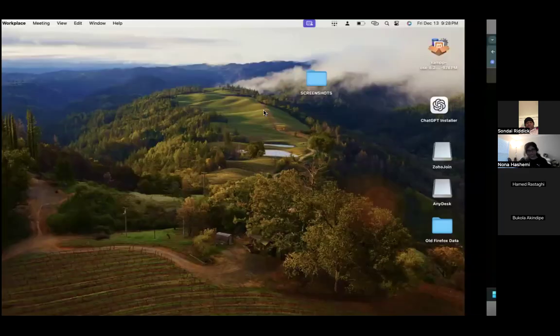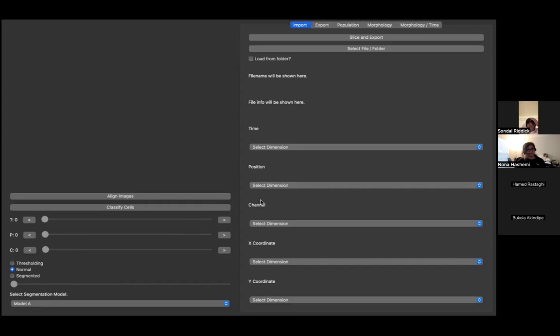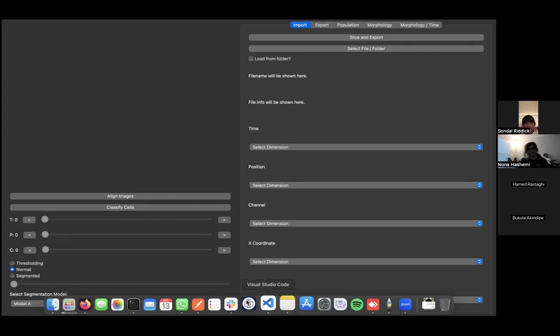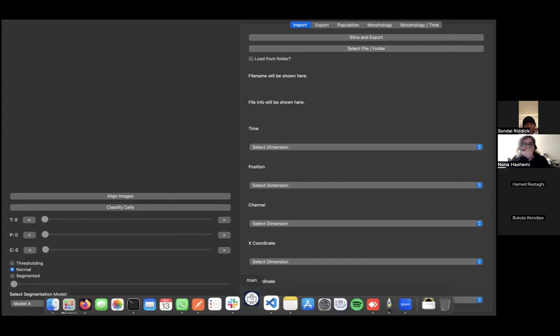I'm just doing a summary of everything in point one and two right now. So this is the tool, right? I'm going to create a clickable application for you, which I've done already, but I've not moved it into the microscope computer yet. You can see something like this. I had to create a logo for it. You just need to click it, and it's going to open, and then you can perform whatever you want to perform. When I'm done updating the application, I'm going to do that on the microscope computer, so you don't have to be running it the way we developers are running it.